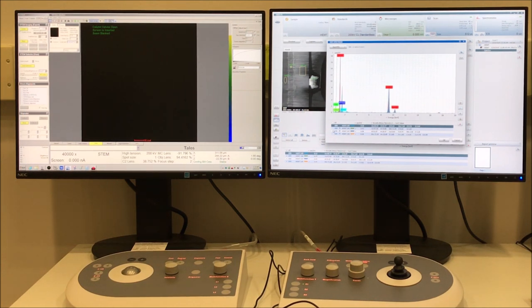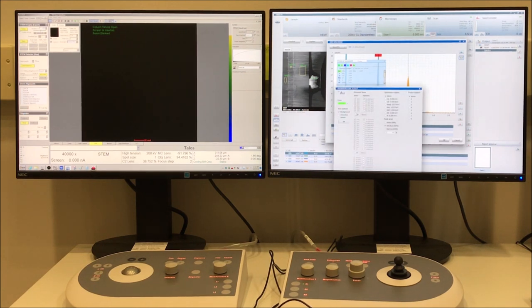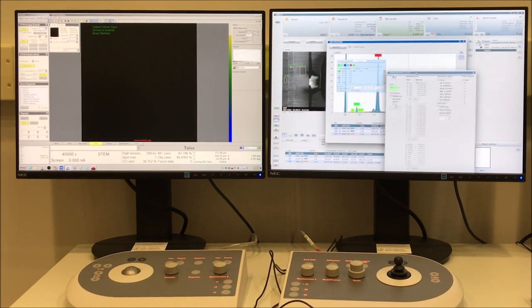And I only have one spectrum on here, so if I add another from the list below, then I will see both of them on there. And again, you can manually add peaks as well for those. I believe when you do auto ID on this, it only auto IDs the spectra, or spectrum I should say, that you have activated. So that's a gold peak.